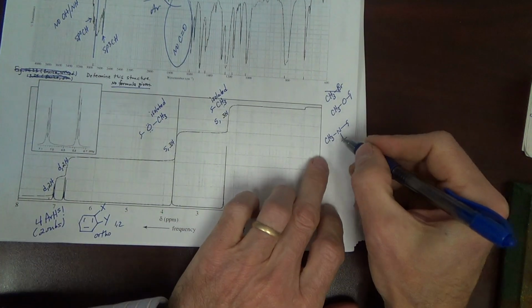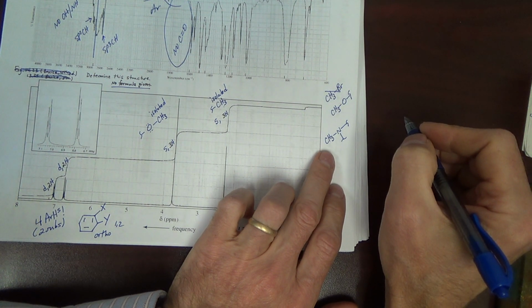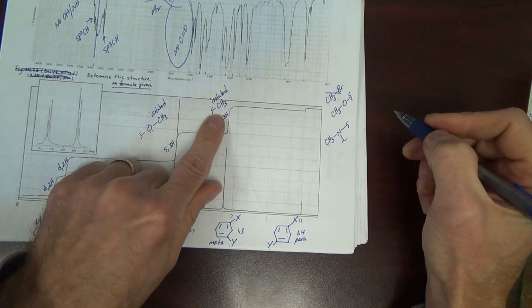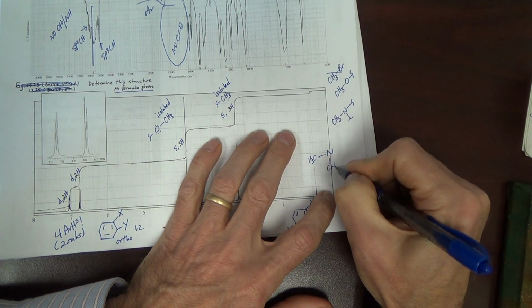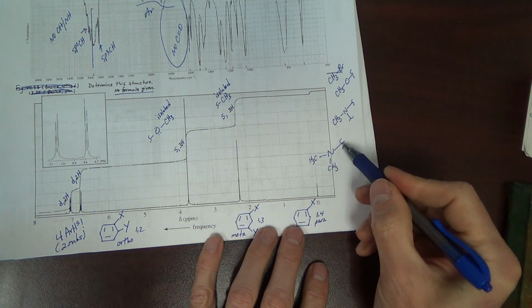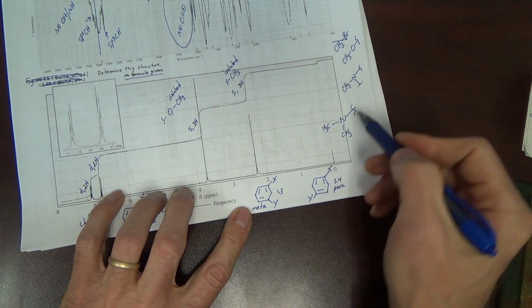Now, I'll end here. How do we know it's not this nitrogen here? Because you don't have enough peaks here. If the other CH3 was on the nitrogen, then you would have two CH3s, then you would only have one other place for the ring, but you need to be able to connect to the ring twice. So that doesn't match.